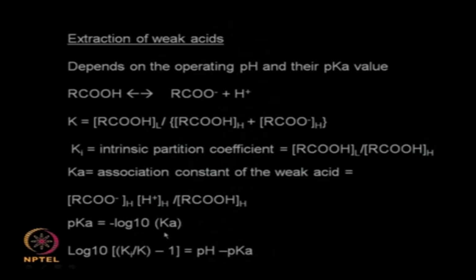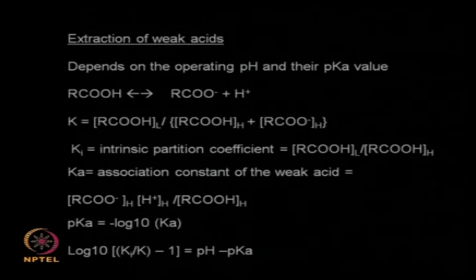So one important point you need to keep in mind is that the K varies depending upon pH for weak acids and weak bases. So you need to identify the best pH so that your K is maximum. If the K is maximum, you are going to have a good extraction. So you may have to do a lot of experiments, on the effect of pH on the extraction efficiency, before you decide on the pH.